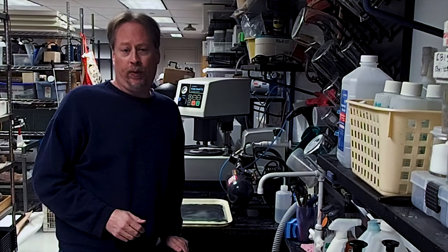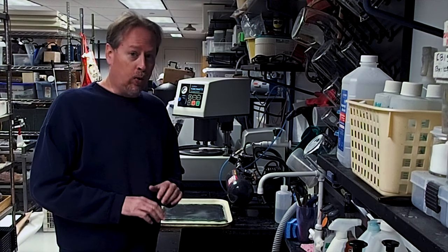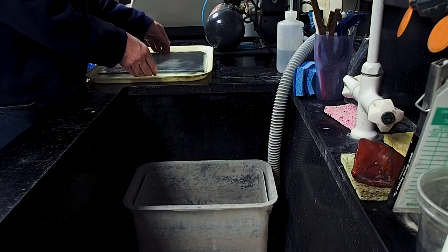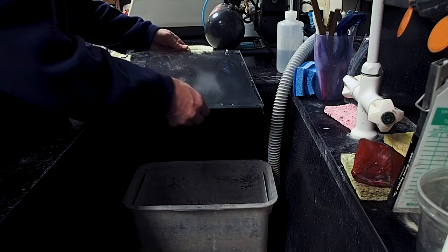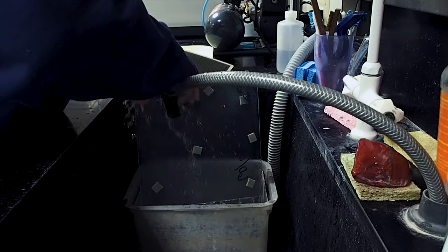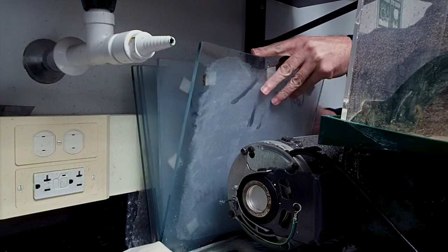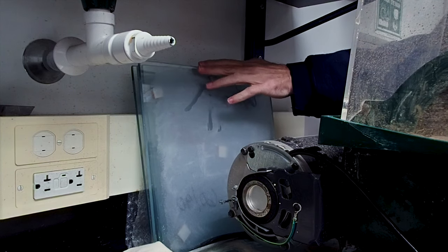Even if your sink is equipped with a sediment trap, which ours are, rinsing this amount of grit into the sink will quickly overwhelm it. Instead, we rinse our glass plates off into a separate container where the grit can accumulate and settle out for appropriate disposal later. When you are ready to proceed, make sure you have selected a glass plate associated with the next grit size, and repeat the same procedure as before.